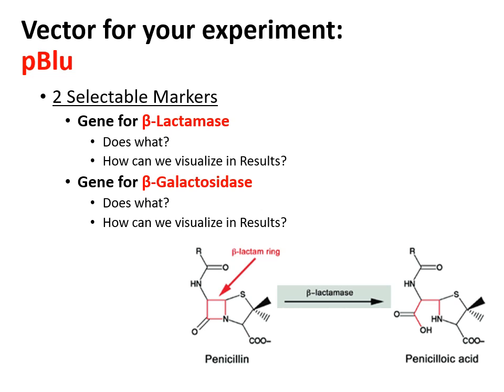In addition to that, the pBlue vector also has a gene for beta-galactosidase. That is responsible for color detection. So what beta-galactosidase does, ultimately, when you talk about genetics, you see beta-galactosidase as being part of lactose metabolism. Now, beta-galactosidase is able to cut disaccharide sugars into their monosaccharide parts.